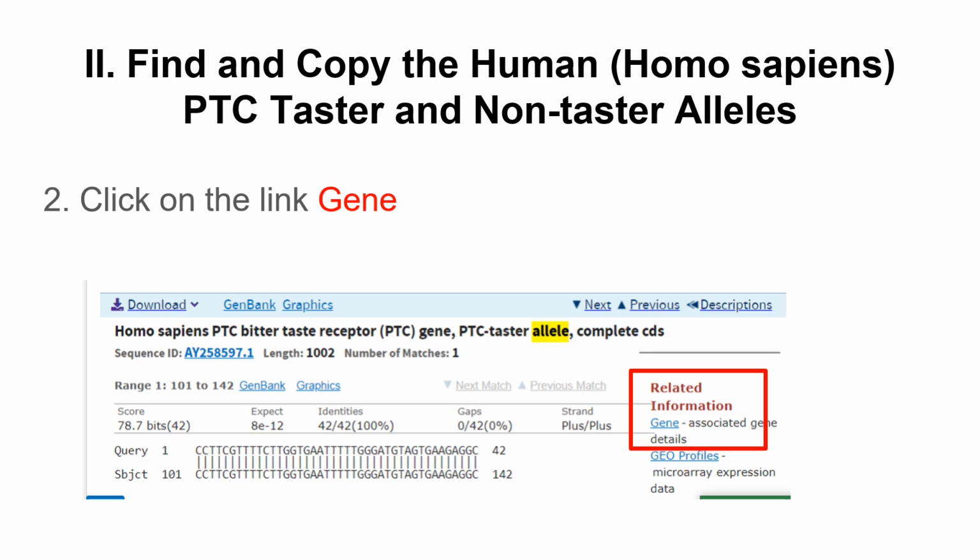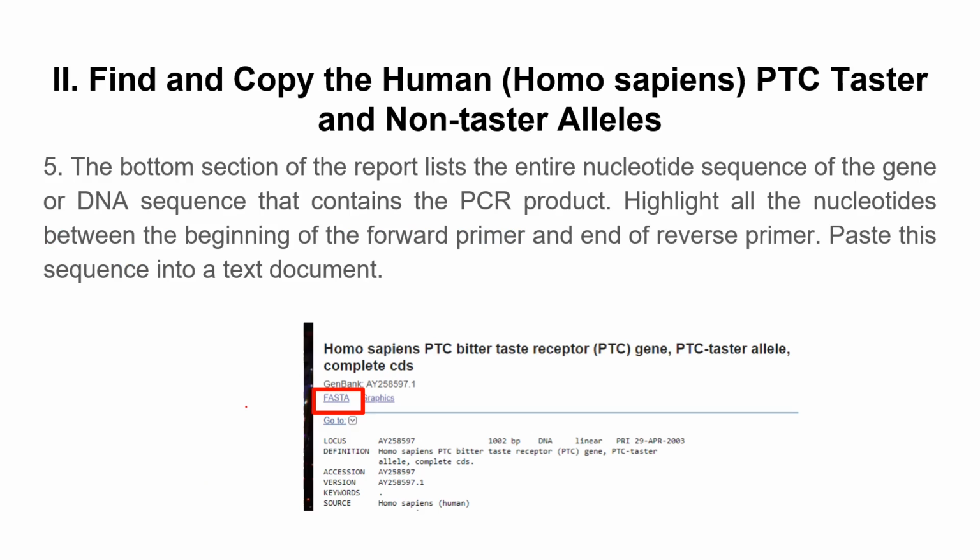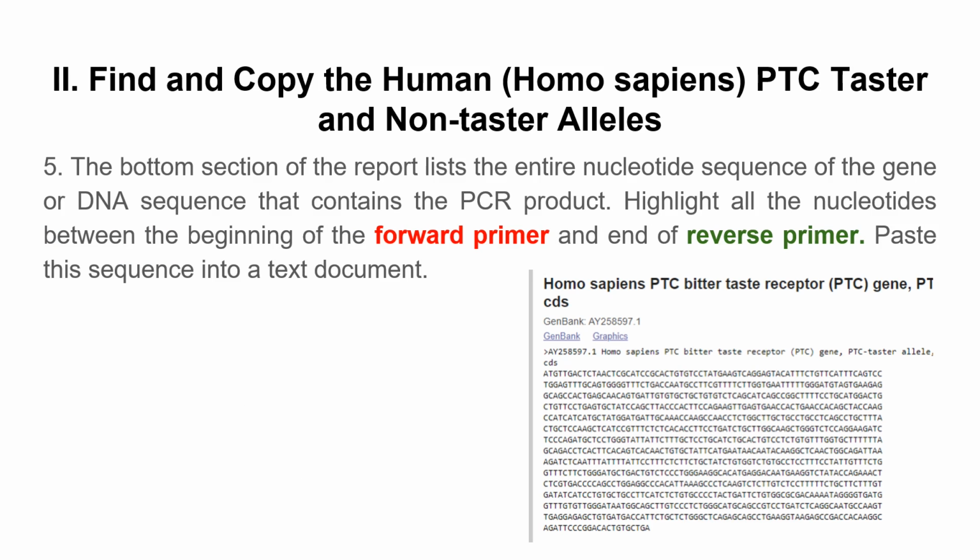Here you can focus on trying to get the gene. You can have the accession again, and the locus of the gene, where it's located. Here they tell you that this is from a human. Here you can get the FASTA again, which they already explained before, so here you have the entire sequence. Remember that the protein sequence will be much smaller, while the DNA will be at least 3 times longer. So sometimes having this FASTA can be very useful.